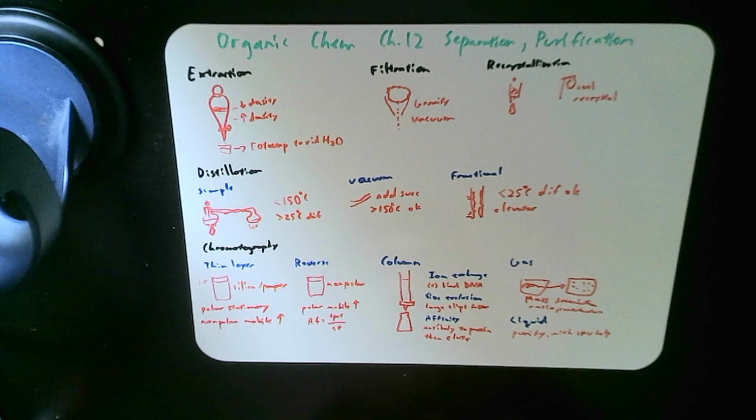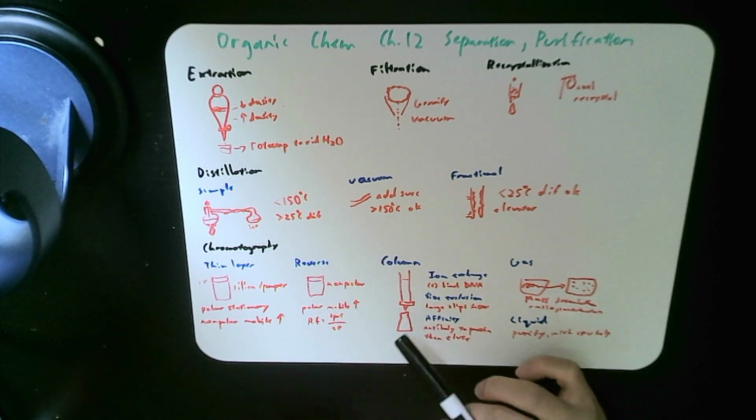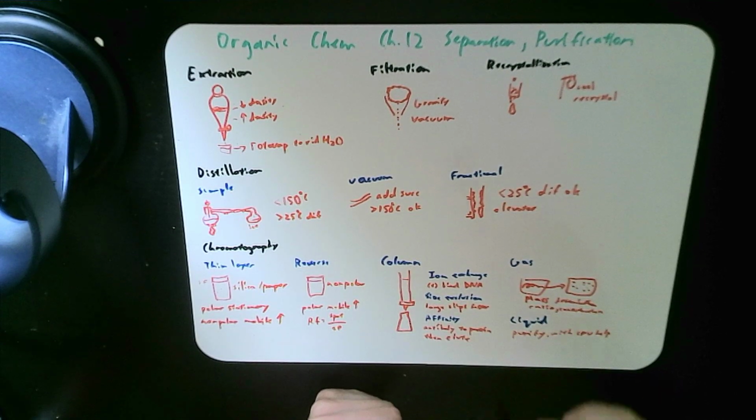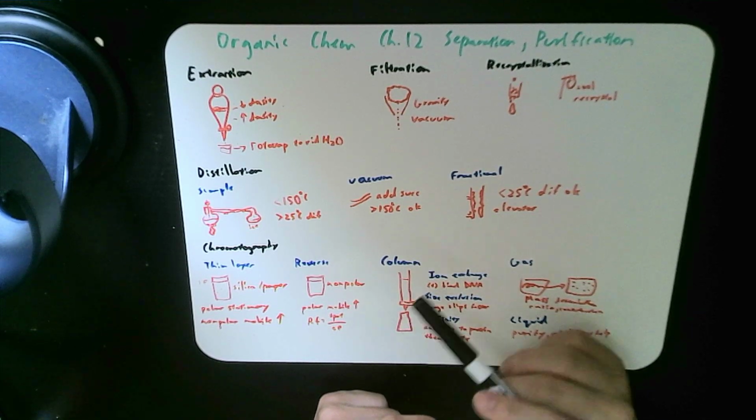That's exactly what ion exchange does. It has the beads that are positive, that bind to the DNA, so then they can later switch out a new flask and pour some salt solution to wash the DNA away from the beads.